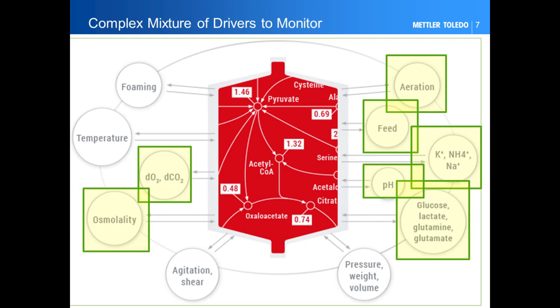It means that at fixed inputs, speaking of temperature, pH, aeration, the accumulation rate of CO2 and its rapid variation is going to affect directly the pH stability that is required and impact the process.